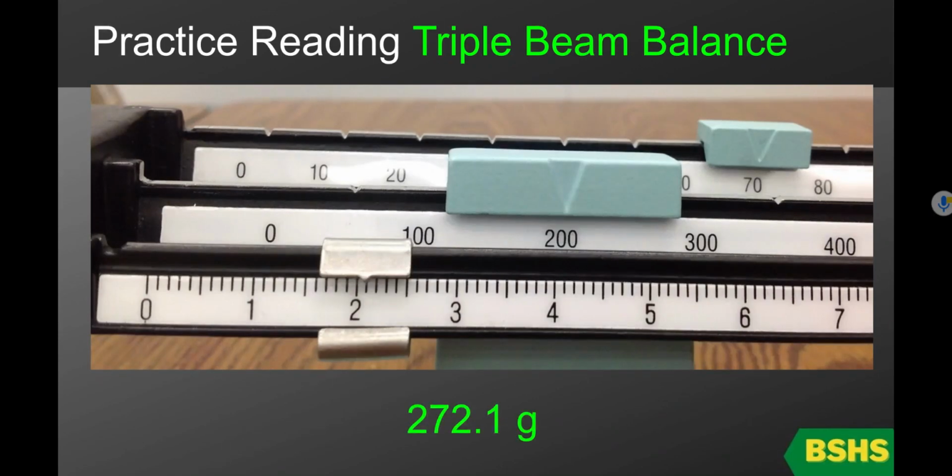How did we get that? Read the middle scale first. It says 200 grams. Read the top scale second. It says 70 grams. Read the bottom scale last. It says 2.1 grams. Again, the 0.1 is because you're one of those small lines past the number 2. So 200 plus 70 plus 2.1 equals 272.1 grams total.